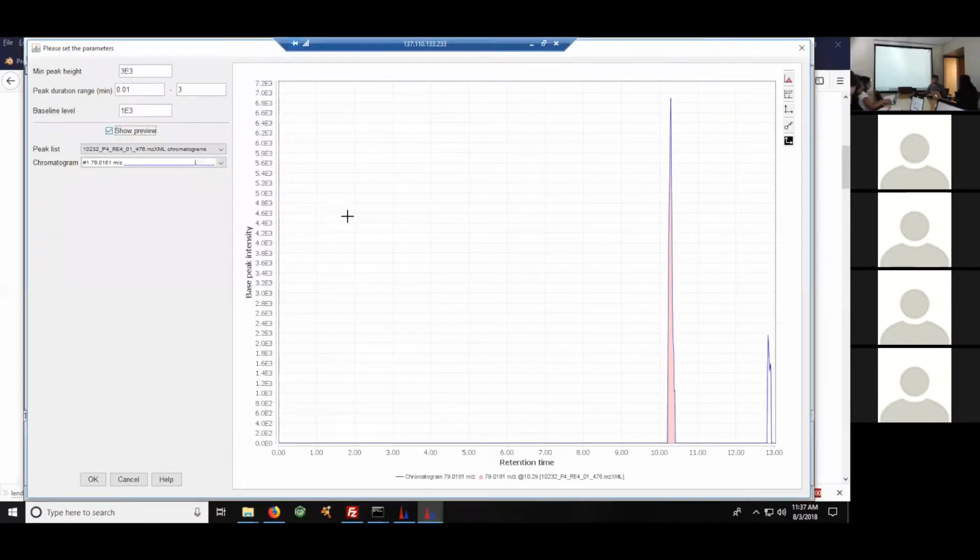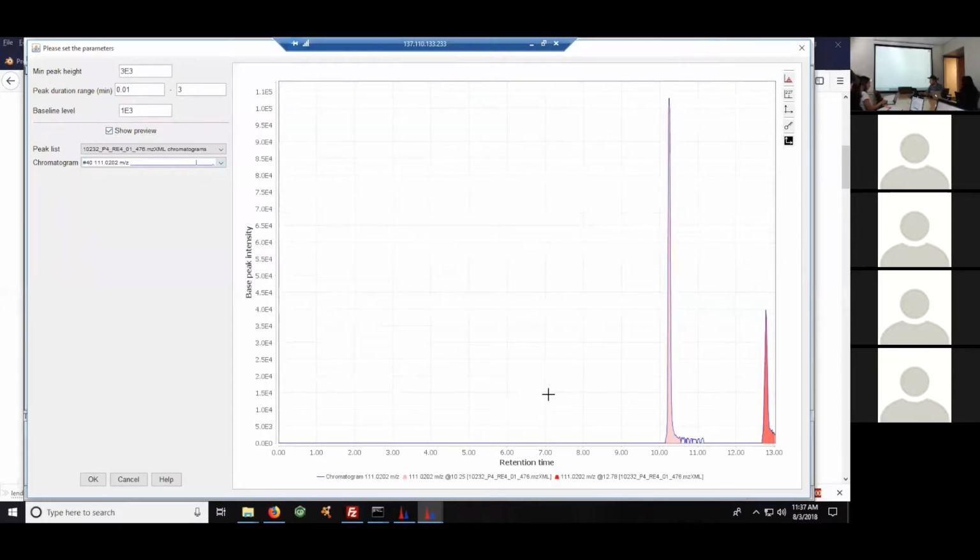To assess this, I think the preview will really help us, because when you have to question what algorithm shall I use, you can just try this with the preview and go through a bunch of examples. So in this case, you can see that this would be considered a peak with pink color. And then there's the red one, which is a peak. So here it apparently does a good job, right?